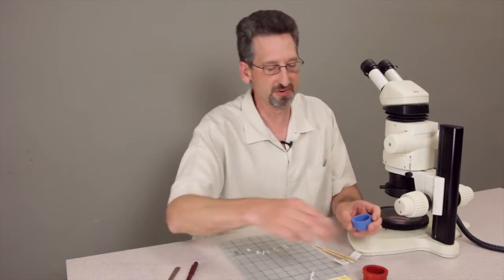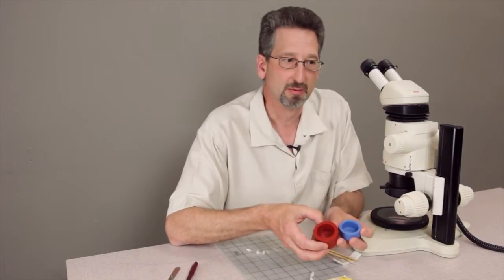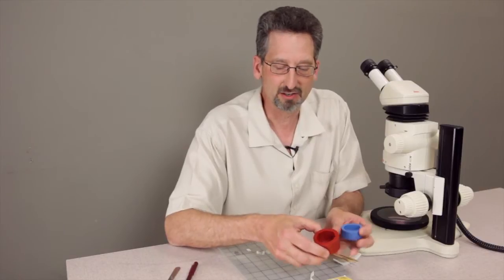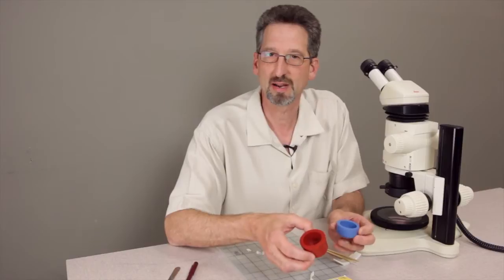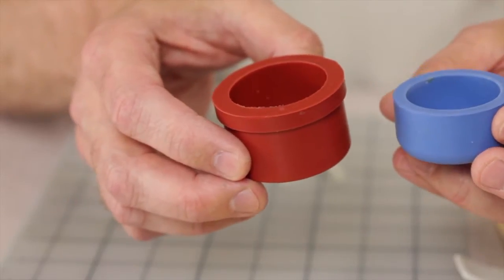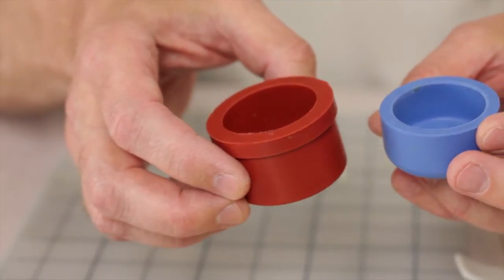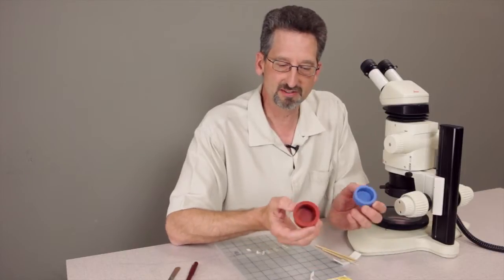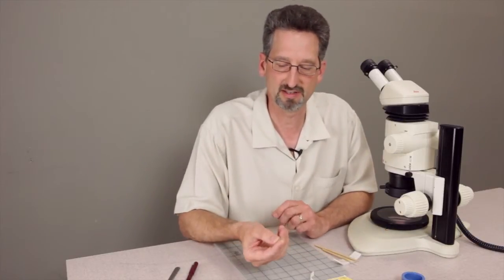Part of this was driven by the design of industrial microscopy and the fact that they could afford to use more sample than we are able to in the microscopy or analysis of historically important objects. So from this size we've gone to something that's sub-millimeter.